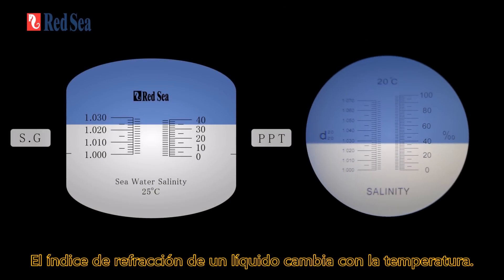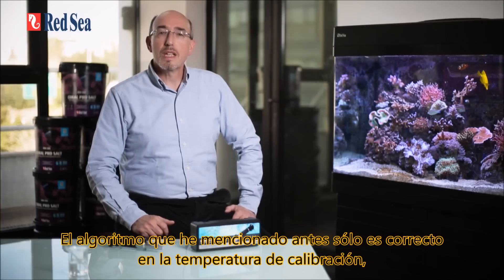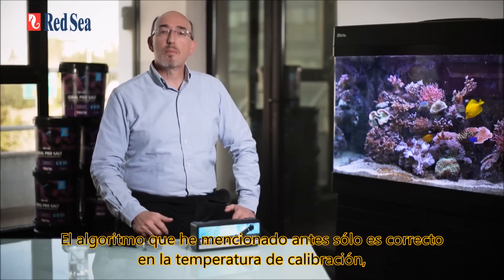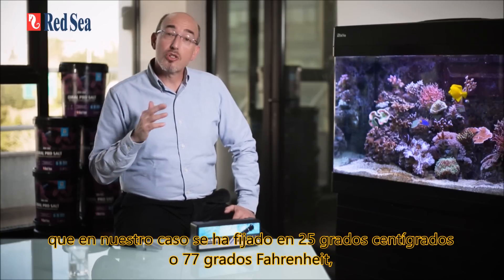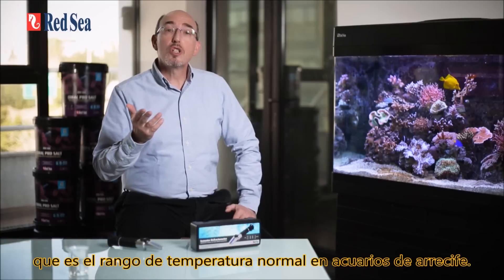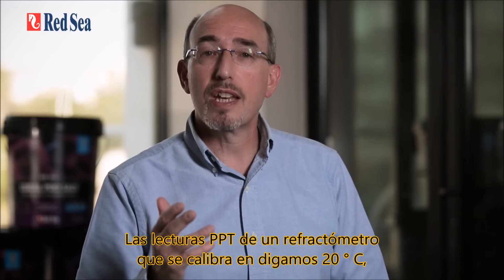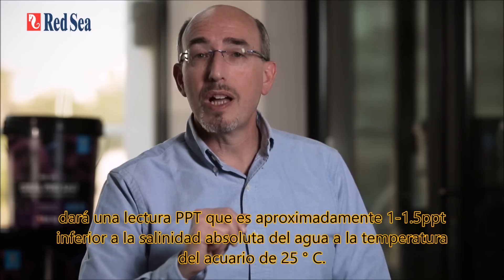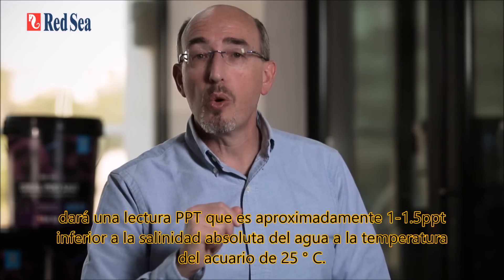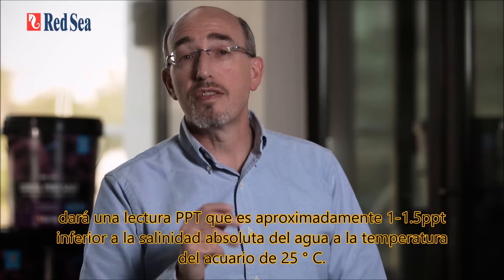The refractive index of a liquid changes with temperature. The algorithm mentioned before is therefore only correct at the calibration temperature, which in our case has been set at 25 degrees centigrade or 77 degrees Fahrenheit — the normal temperature range for reef aquariums. PPT readings from a refractometer calibrated at 20 degrees C will give a reading approximately 1 to 1.5 ppt lower than the absolute salinity at the aquarium temperature of 25 degrees.